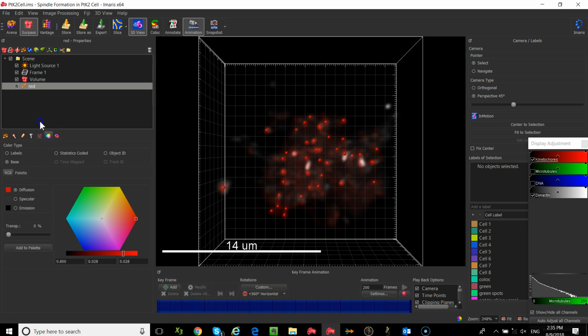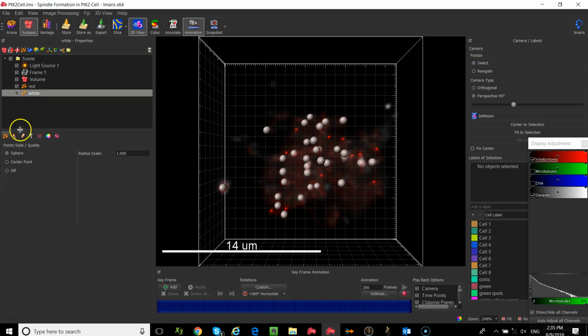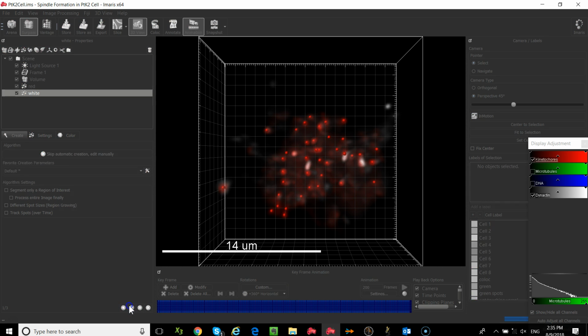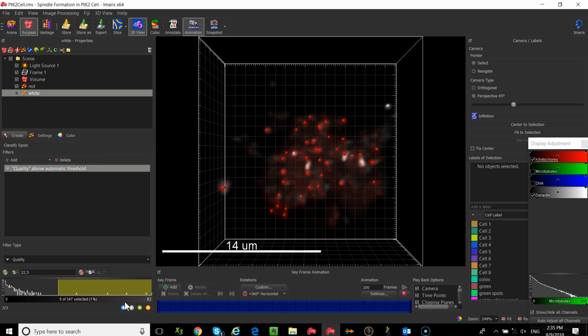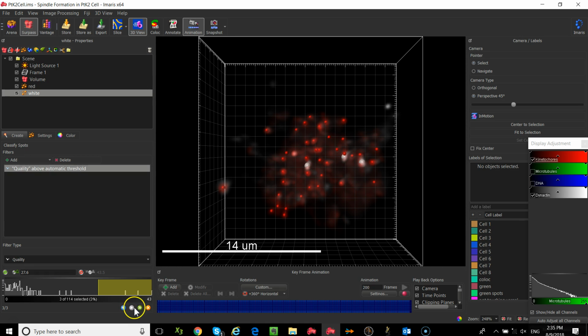Okay. I'm now going to go in and do the same thing for the dynactin, which is white. Same thing. So I'm going to, oops. That was my bad. I hit the finish button before I was ready. So I'm going to go back in and do this again. So I'm going to go back through, choose the dynactin, change that to about 0.35 or 0.3, whichever. And to be honest, I think that's a little small. I'm going to use a slightly bigger value. Yes, that's a little bit better. So now hopefully you can see I chose a value of 0.6.